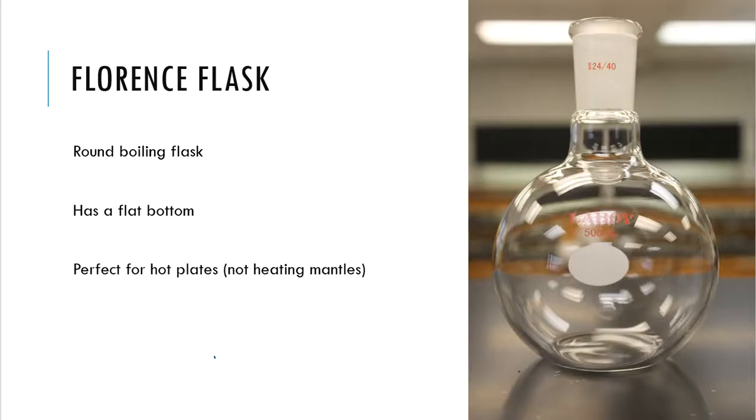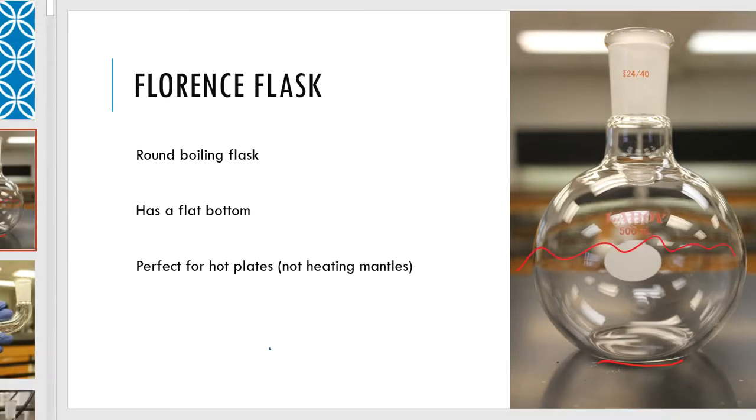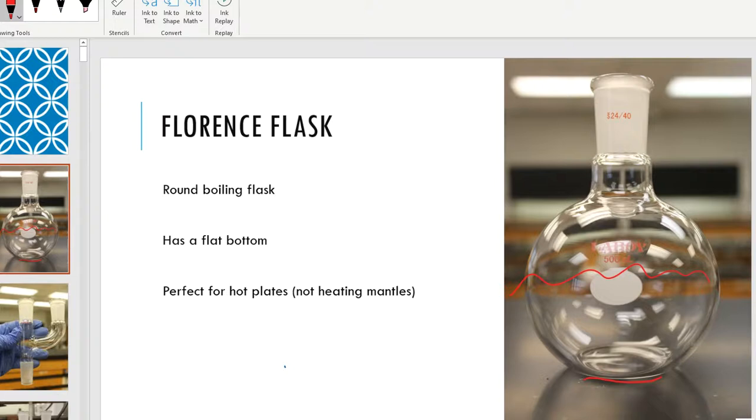The very first thing I'm going to pull out of the drawer is something called a Florence flask — like Florence Henderson or Florence and the Machine. It looks like a round bottom, but the difference is that it has a very flat bottom. It can sit on a flat surface, like a hot plate. The only thing we're going to put into this is water.